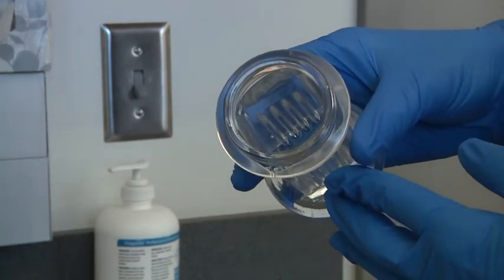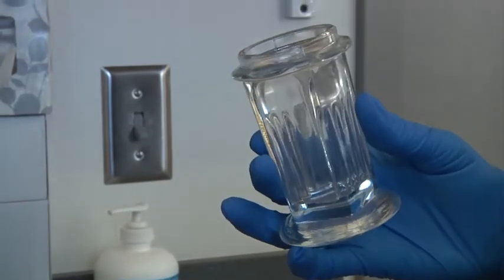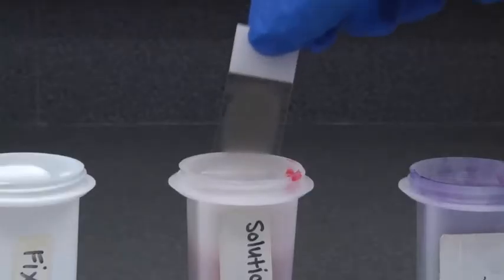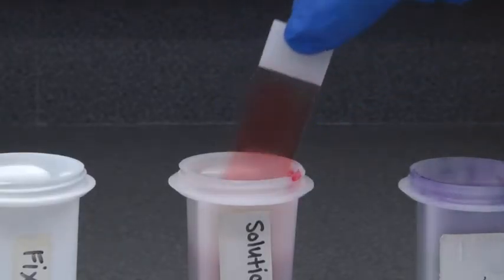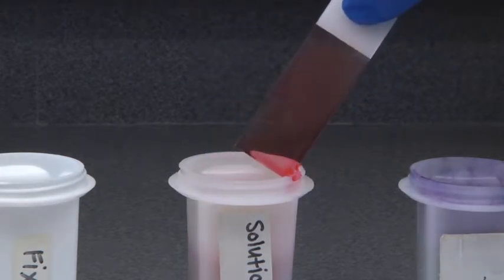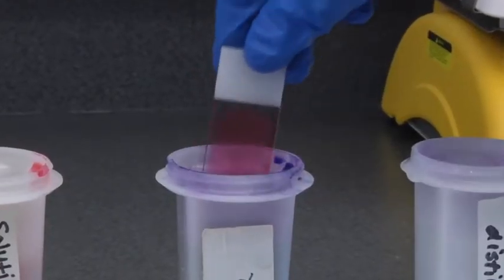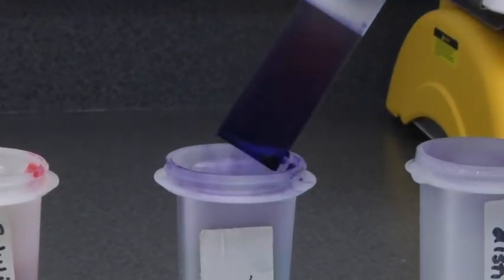In Coplin jars, there are ridges to keep slides separated from each other. For our purposes, you will not be using them, so dip at an angle and run the edge of the slide along the edge of the jar while removing it from the stain. This allows excess stain to be removed from the slide. Then, dip the slide 5 times in methylene blue.